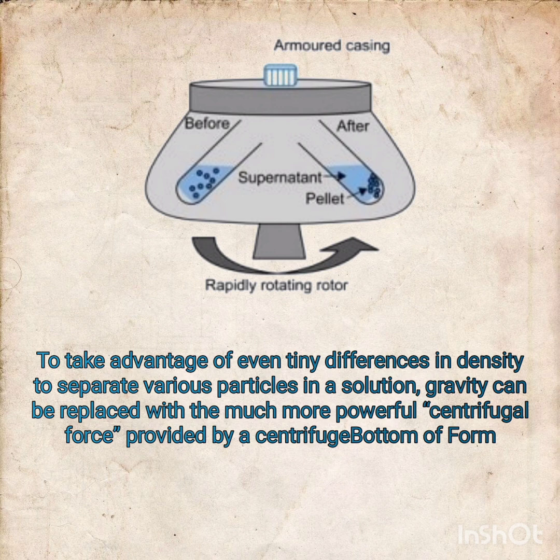This helps the particles to be removed from the solution, and the solution then becomes smooth and clear.